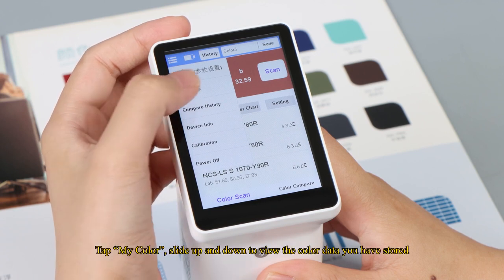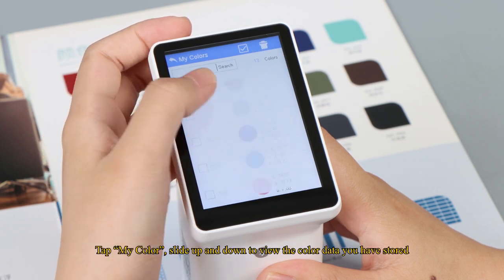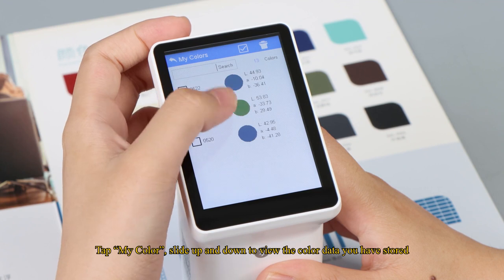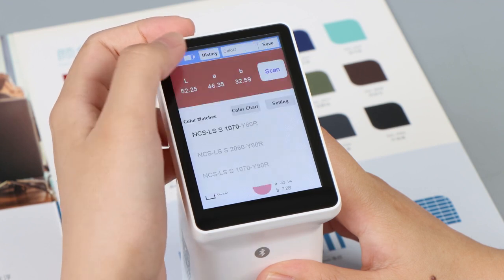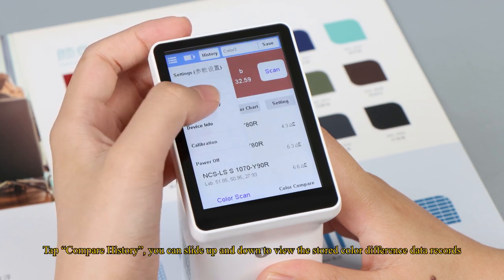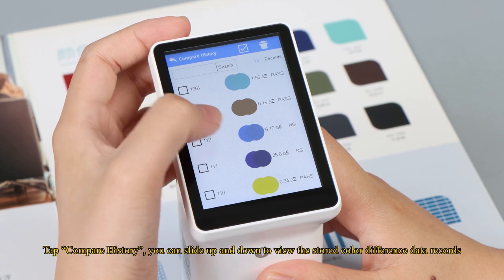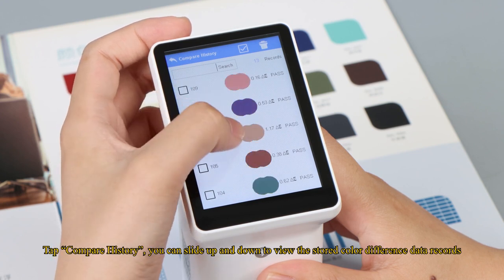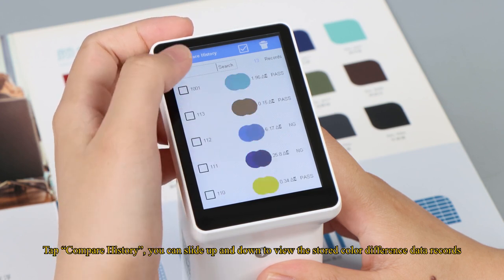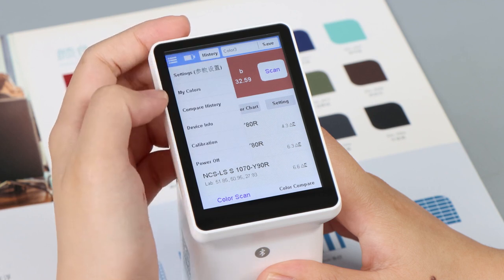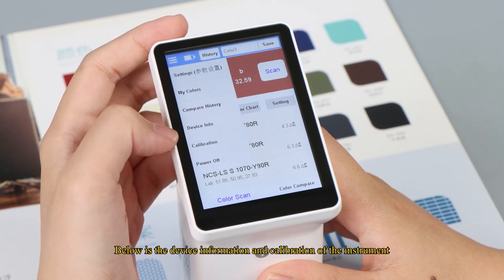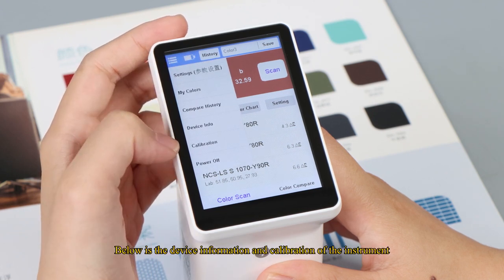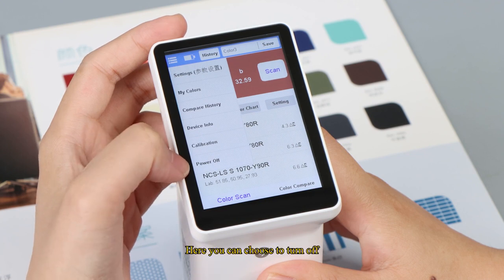Tap my color, slide up and down to view the color data you have stored. Tap compare history, you can slide up and down to view the stored color difference data records. Below is the device information and calibration of the instrument. Here you can choose to turn off.